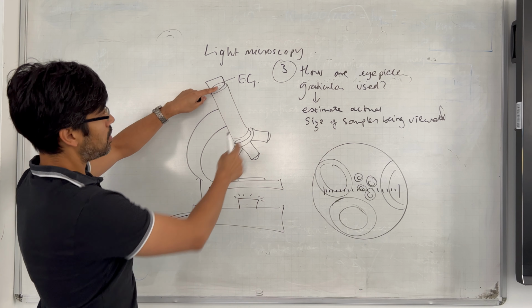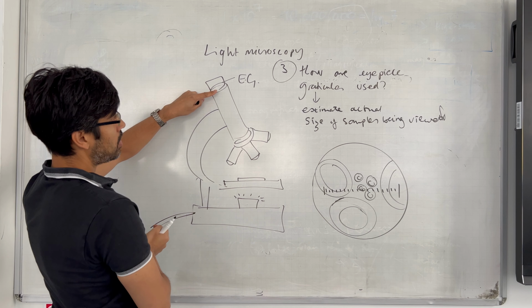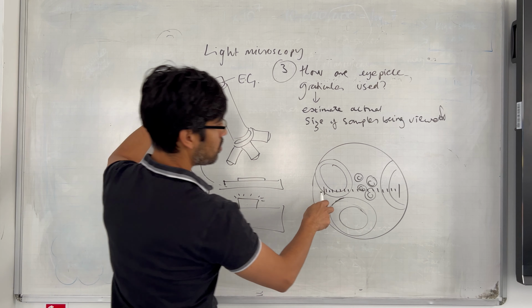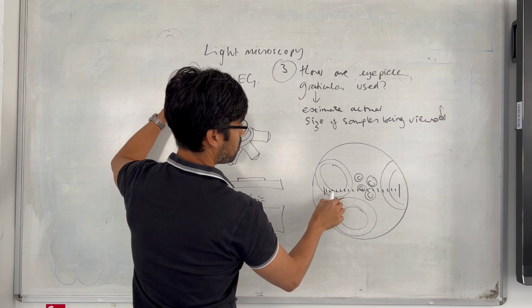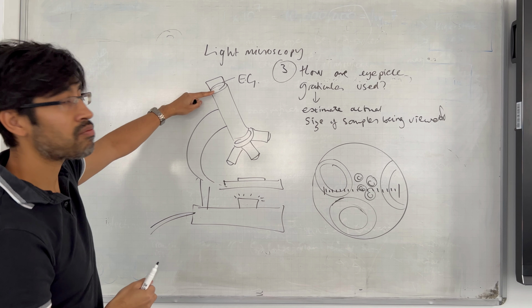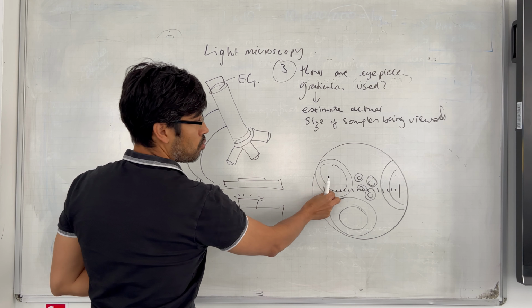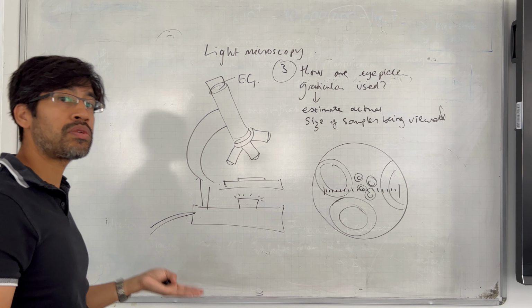But because the magnification is happening due to the objective lenses here, right? This scale has no units. So we don't know, even though I'm looking at this, I might say, oh yeah, that's 1, 2, 3, 4, 5, 6, 7, 8, 9. That's 9 graticule units. That xylem vessel is 9 graticule units wide. But I don't know what each graticule unit is in actual distance.